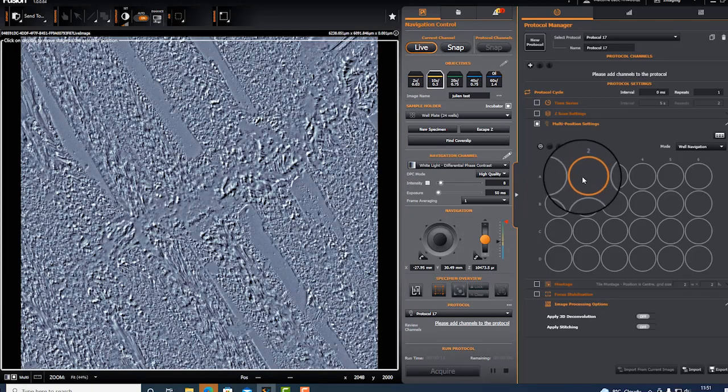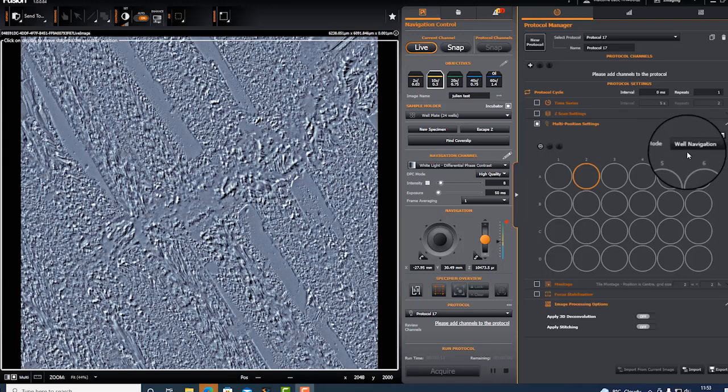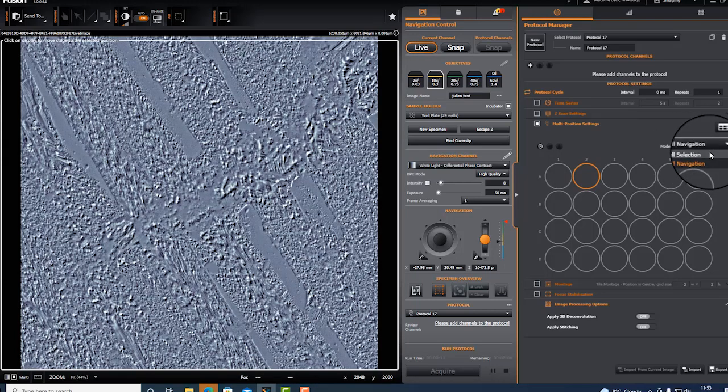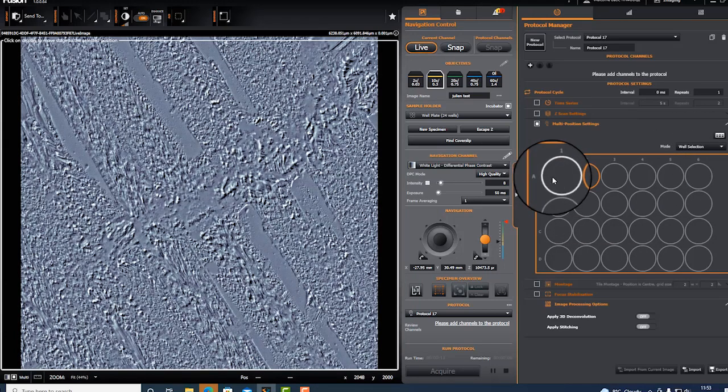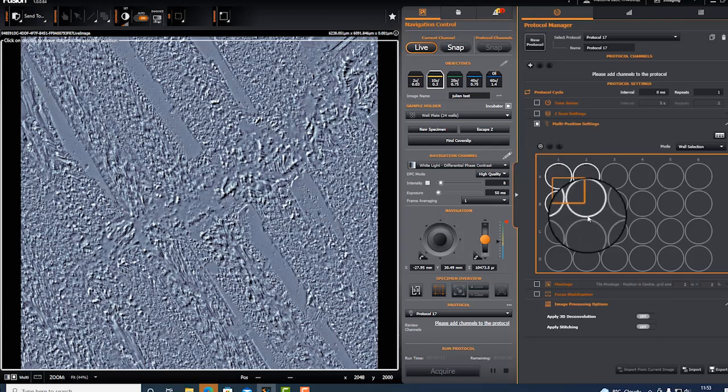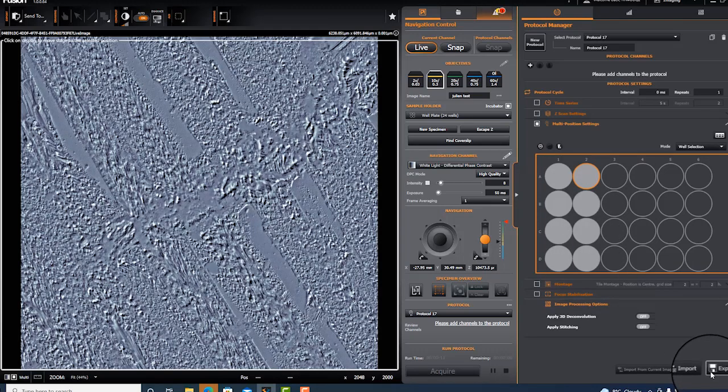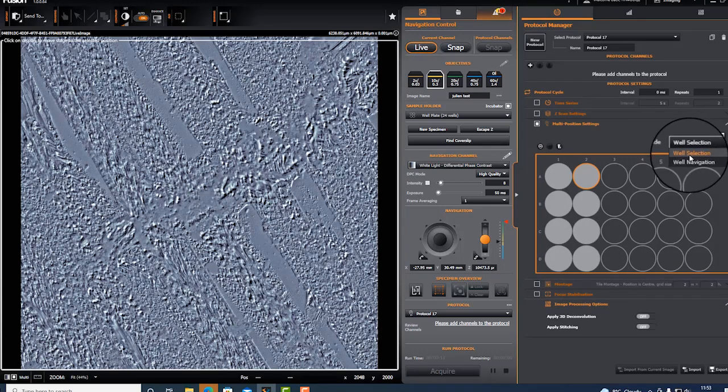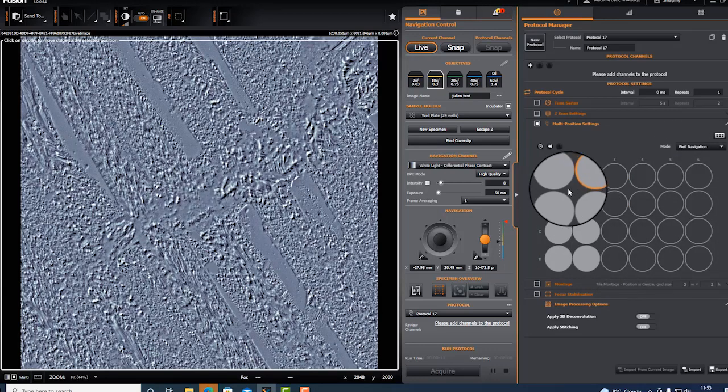You can toggle between well navigation or well selection. I will now add these wells for acquisition, and if I'm happy I go back to navigation.